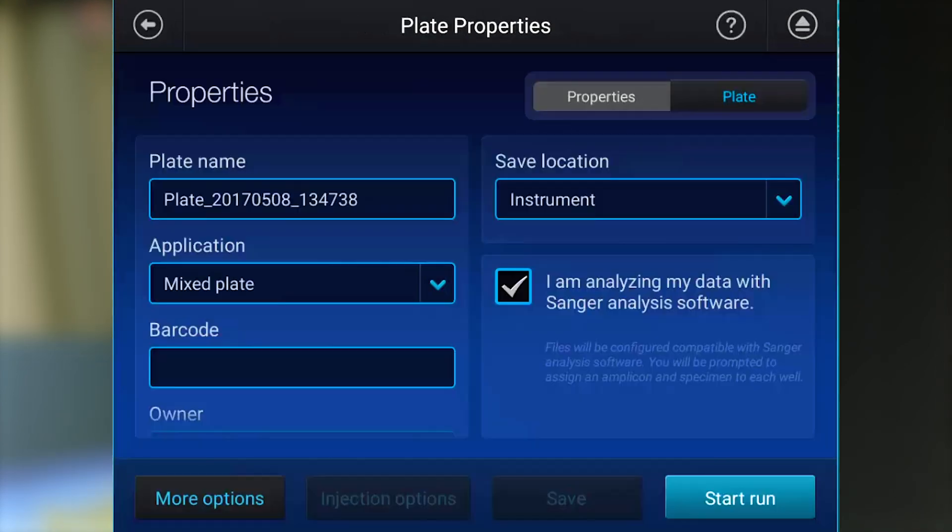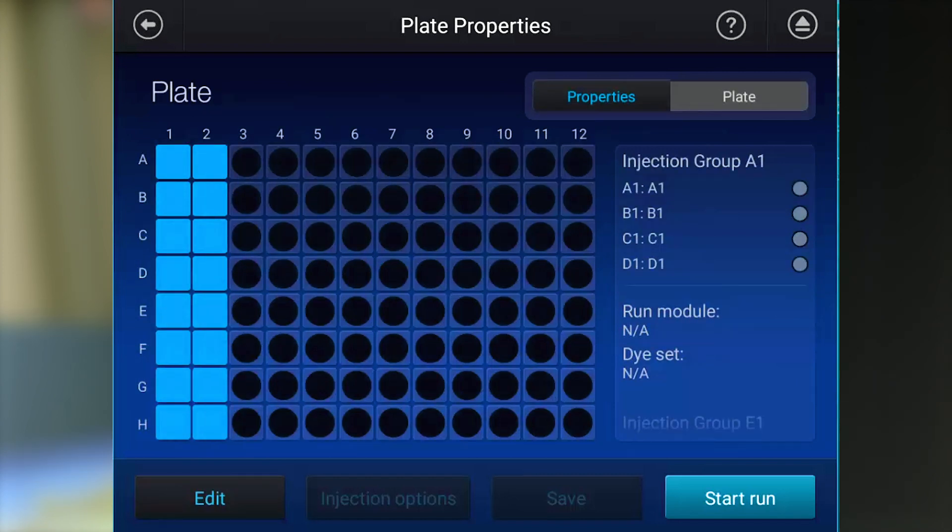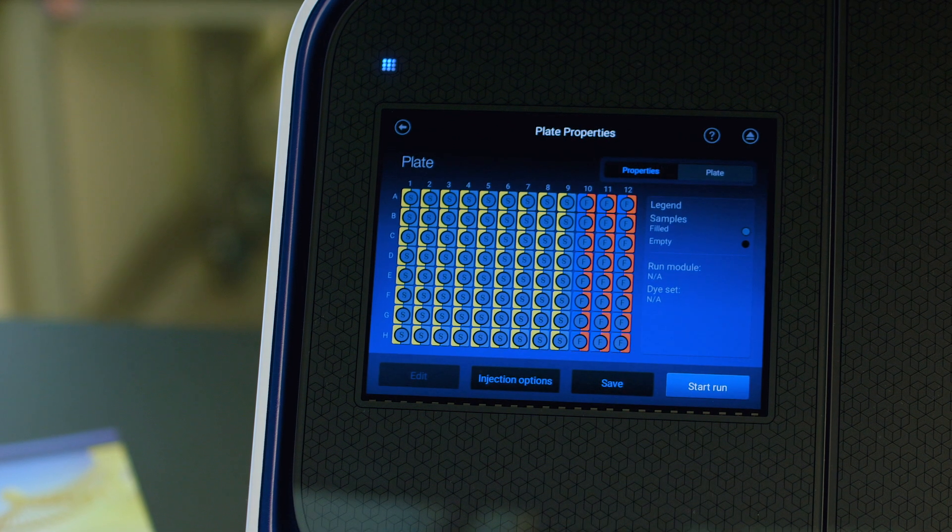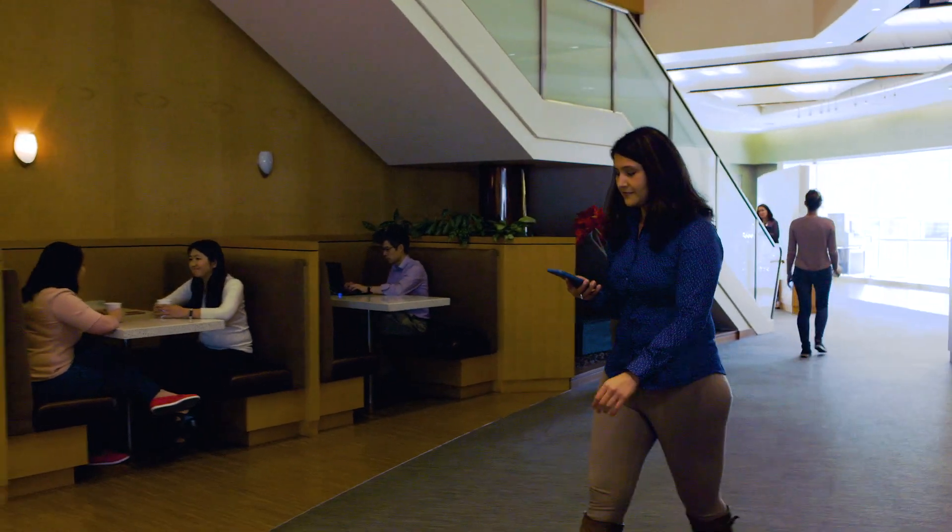You can run both Sanger sequencing and fragment analysis samples on the same plate at the same time. Let's run. Check your run while you get started on another experiment or take a break.